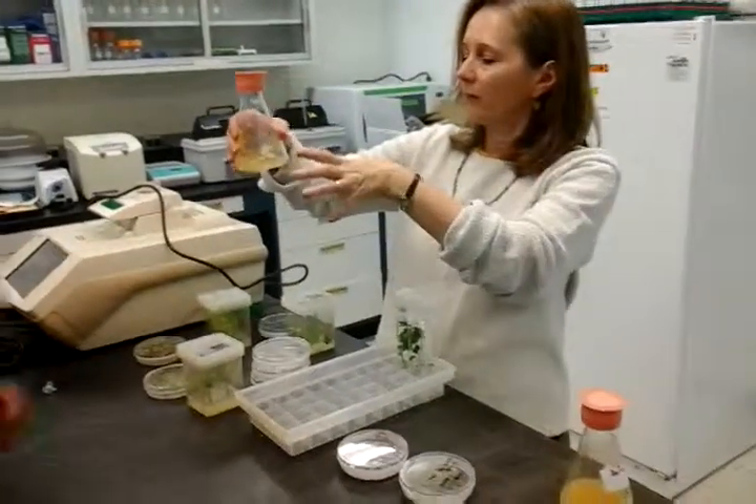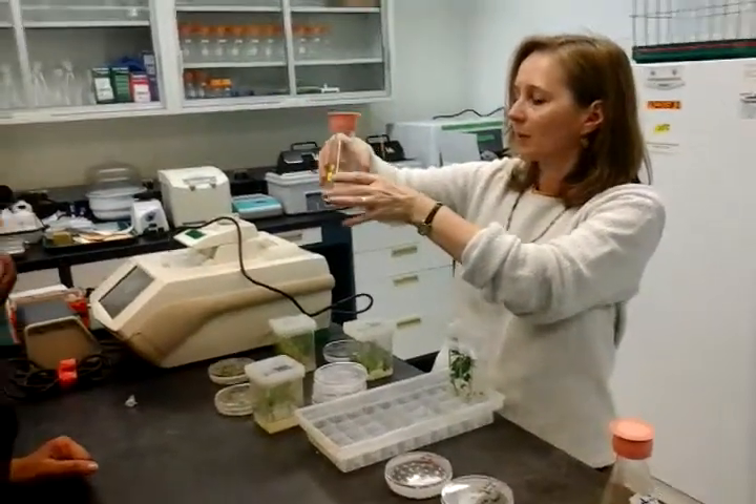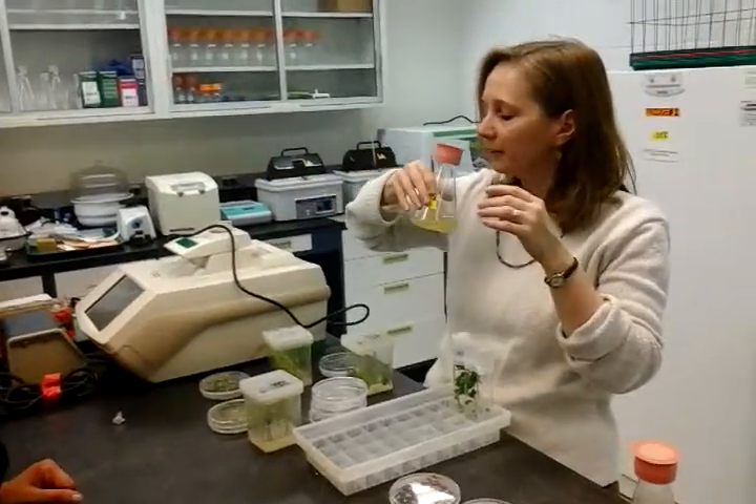For this flask, just hold it by the flask itself, because sometimes the cap comes loose and it just smells lovely. Sometimes if we're not sure if it's agro or E. coli, you can smell it.